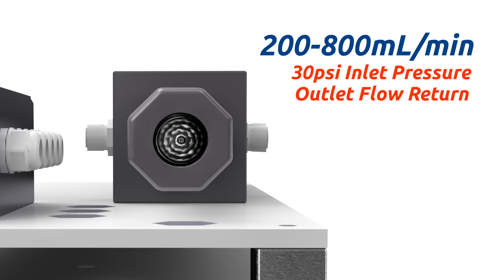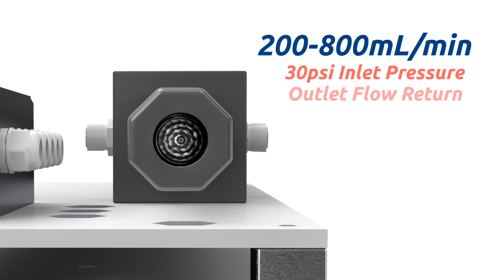The FR300 Plus may be operated at a broad range of sample flow from 200 to 800 milliliters per minute, with a maximum inlet pressure of 30 psi and outlet flow returned to an atmospheric tank or pump for reuse.